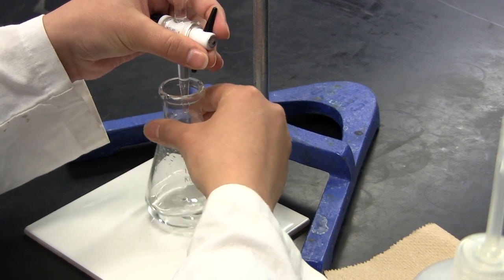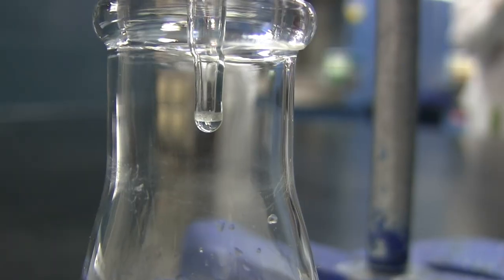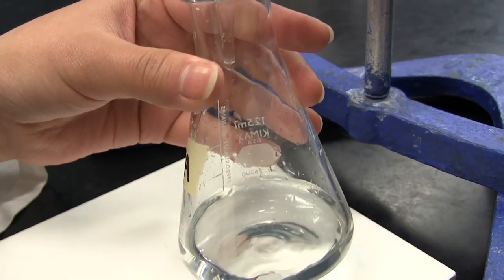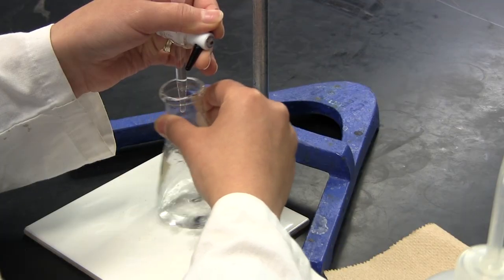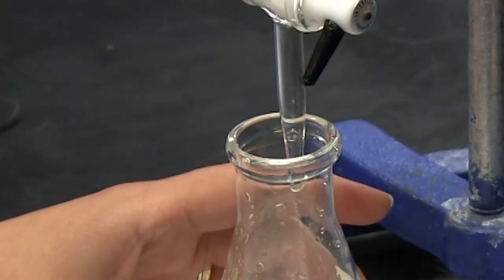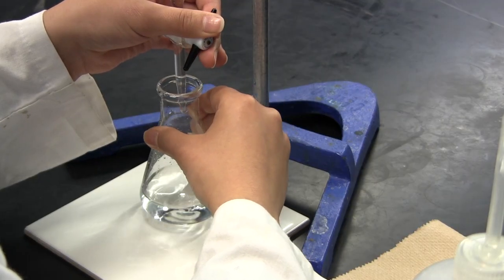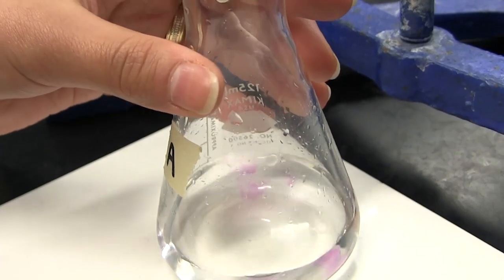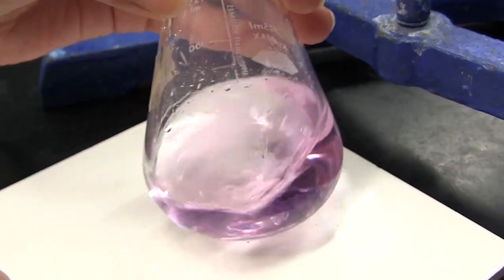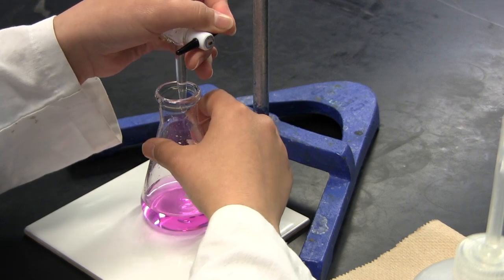Continue adding titrant until the end color of your indicator becomes more prevalent. When this happens, start dispensing partial drops — open the stopcock slightly and let a drop grow on the tip of the burette, then touch the tip to the side of the flask to add the partial drop. Wash down the side of the flask with distilled water to ensure that the partial drop drains into the solution. Try to add progressively smaller partial drops as you approach the end point. When the end point is reached, the palest color of the appropriate indicator will be visible for 30 seconds or more with constant swirling. If you are unsure, take the reading and add another partial drop to see if it is closer to or over the end point.